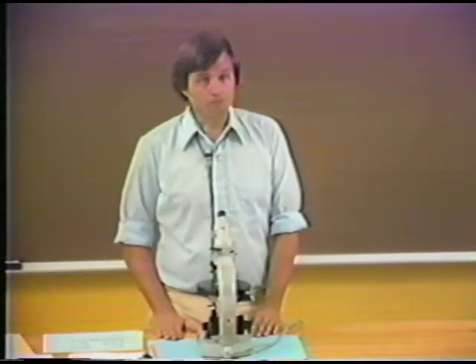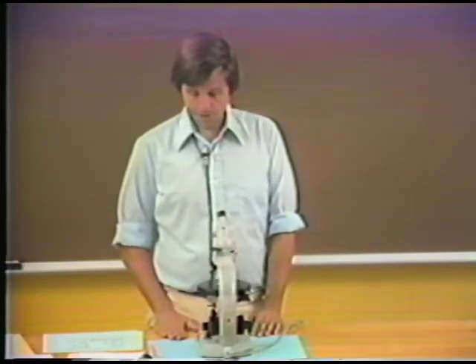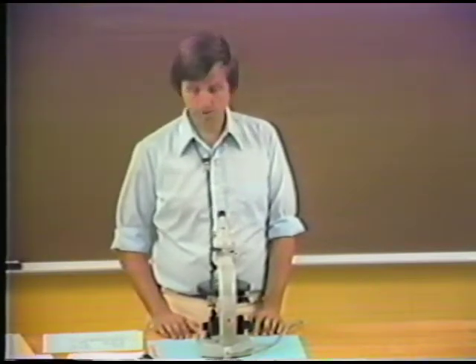Okay, well, we can use the interference figure to show us the position of the E-ray, so that we can actually determine the epsilon refractive index.